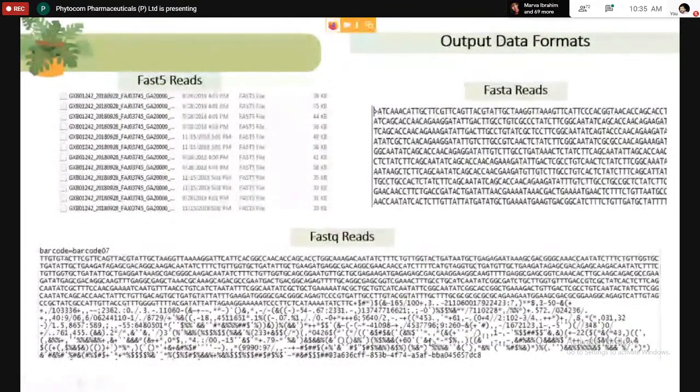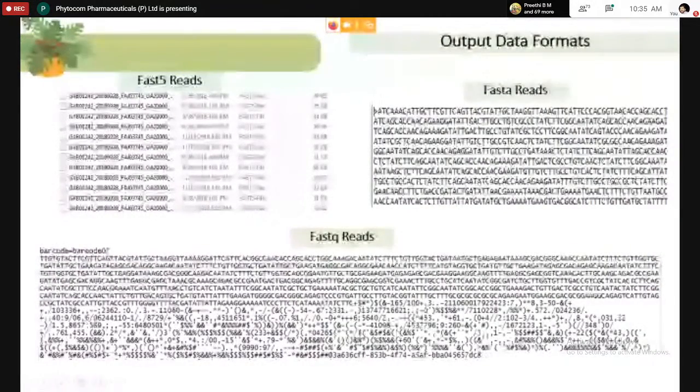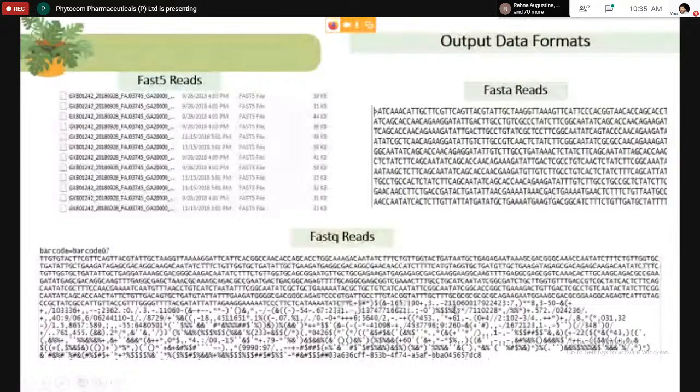In the FASTQ reads you first have the DNA sequence, and after that the details such as at what time, through which pore, and how many minutes the DNA was sequenced. All those details are in this script you are seeing below. You have to keep the FASTQ reads safely when doing sequence analysis for nanopore data. If you change anything in it, further sequence analysis becomes very difficult. So always keep the FASTQ reads safe without removing any asterisks, commas or full stops.